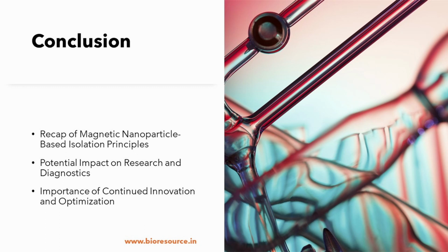So let's look at the potential impact on research and diagnostics. The MNP isolation streamlines the research workflow, saving time and minimizing sample loss, and this allows researchers to delve deeper into the various fields of molecular biology. And the high purity and efficiency of MNP isolation is very crucial for advanced techniques like next generation sequencing and gene editing using CRISPR technology.